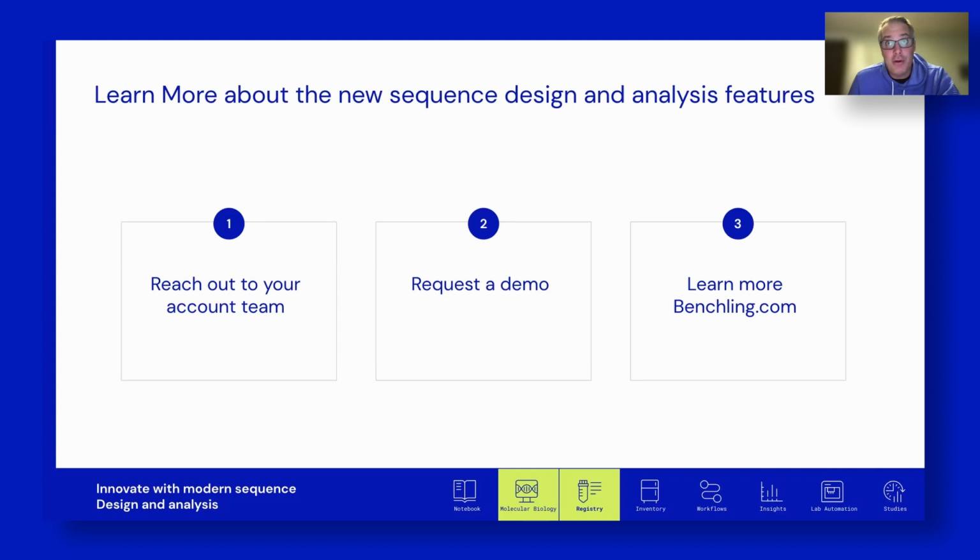That was a brief look at some of our latest sequence design and analysis features in Benchling Molecular Biology, as well as AlphaFold Beta. We're happy to demo this or other sequence design functionalities live and help you decide if this is the right solution for your research. You can request a demo of these new capabilities using the link in the docs section or visit our molecular biology product page on benchling.com.